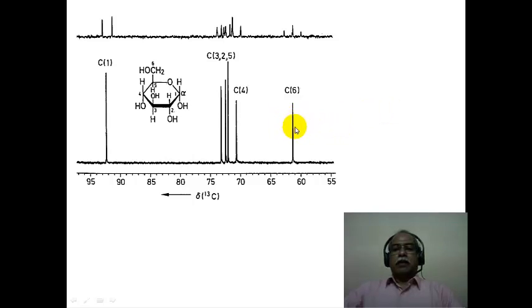When a carbon signal is split into a triplet, as in the case of the CH2OH, for example, you can see the intensity of the signal goes down considerably because this intensity is split essentially into a triplet, so the intensity of each of these peaks in the triplet is much lower than the intensity that one sees in the bottom spectrum.